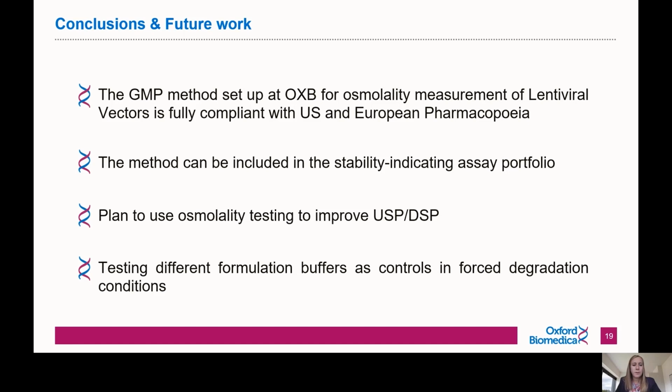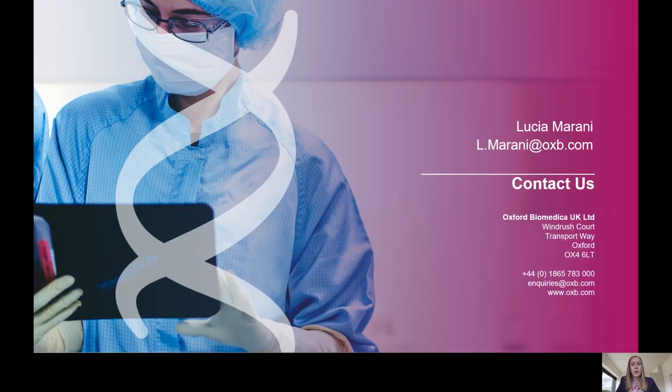And these last points were about testing different formulation buffers as controls in the forced degradation conditions to try and understand whether the lack of a homogeneous sample was due to the buffer itself or other components within the actual product.